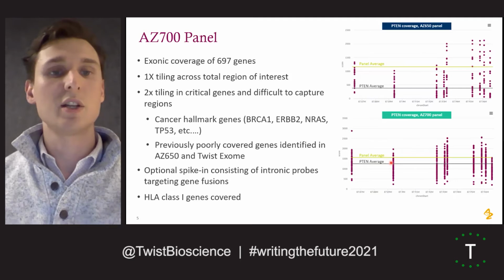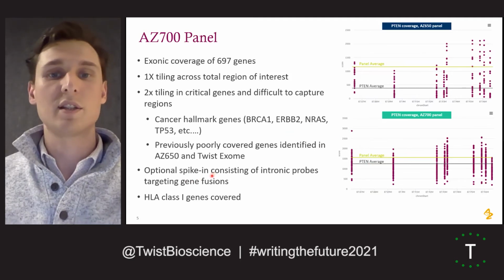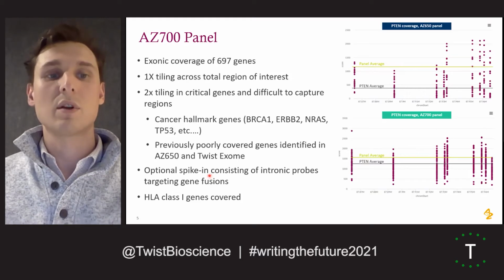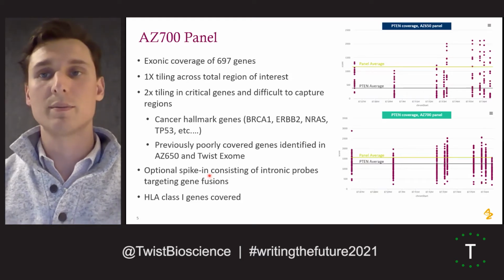So in addition to the regular tiling, there is an optional spike-in consisting of intronic probes targeting gene fusions, and there also are the HLA class 1 genes covered.